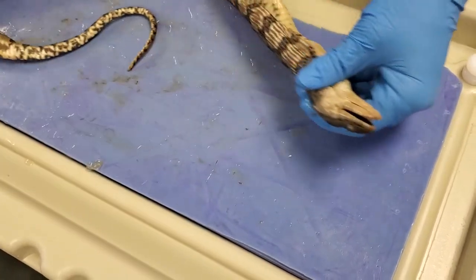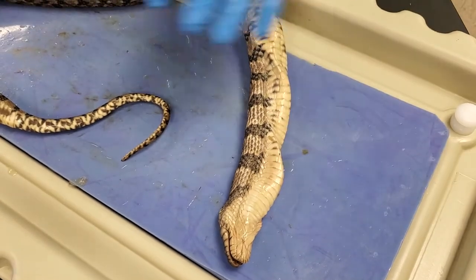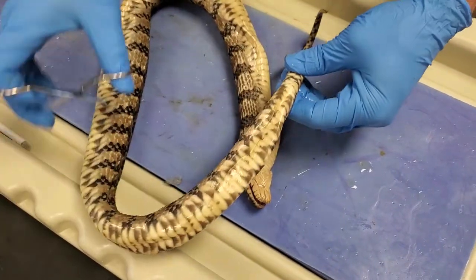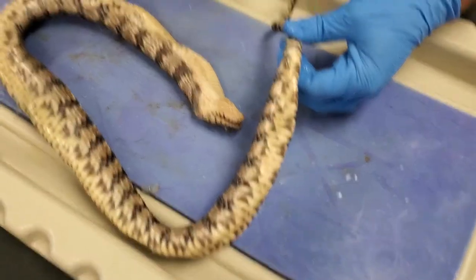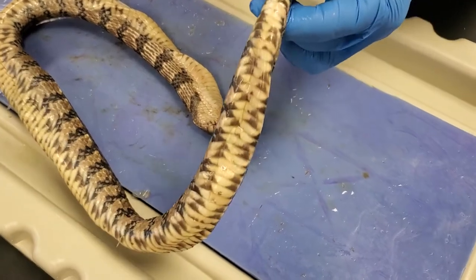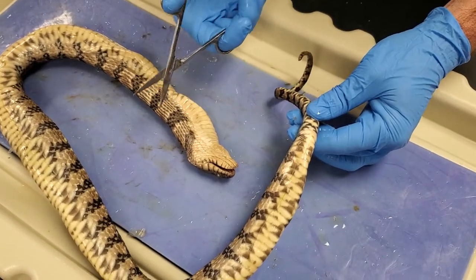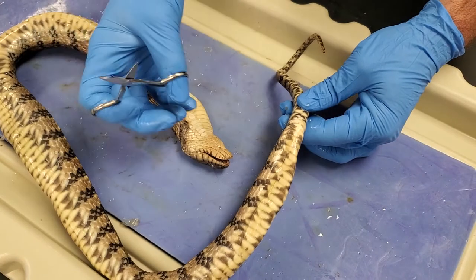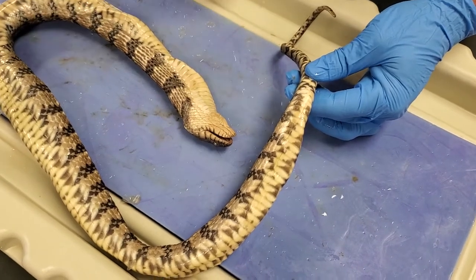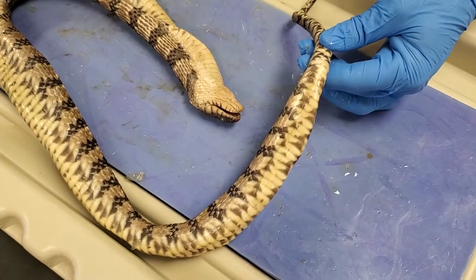So that's a little bit of the external anatomy, and now we're going to go ahead and get into her a little bit. I'm going to say her because I'm thinking it's a girl — I could be wrong. The easiest way to get this going is to use scissors so I can angle them upwards and not cut deeply down to the organs. I'm going to insert at the cloaca — that's the best place to start — and cut all the way up to the neck. Then I'm going to pull out the entire string of organs. It's all wrapped in a membrane called the peritoneum. In humans, we have a peritoneum as well, wrapping all of the organs in our abdominal area.